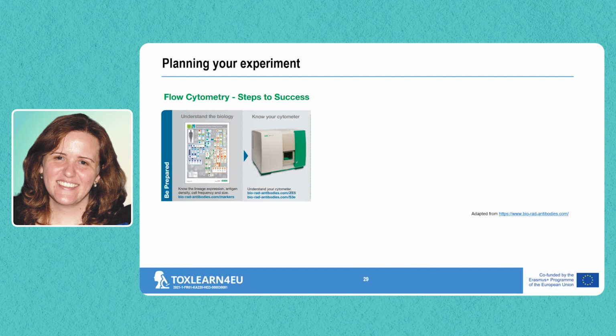At this stage, I can tell you that you should also rely on the technicians of the brand of your cytometer. They know your cytometer the best anyone can know. So it is really helpful to have a good communication with the company. They will help you a lot also in implementation of the assays.